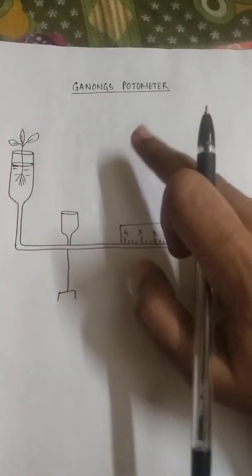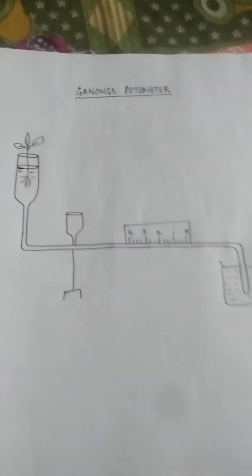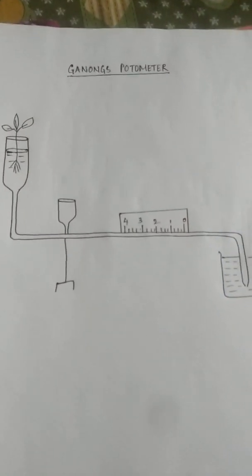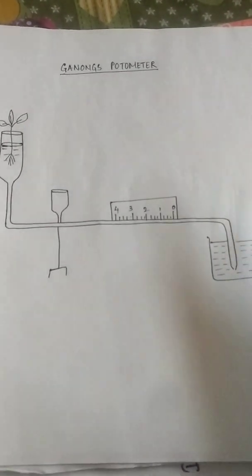Now this instrument which is Ganong's potometer is very much used in biology labs to find out the transpiration rate of a plant.